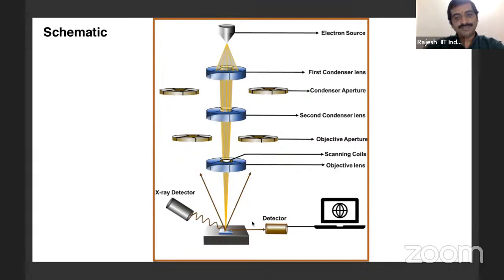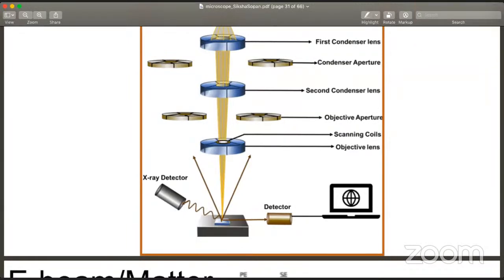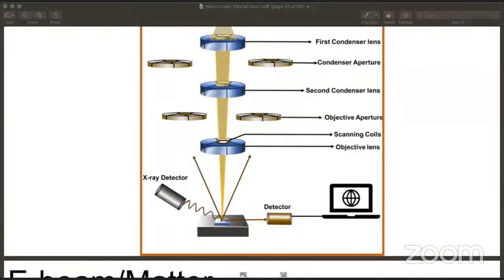If you put it near the surface, the secondary electrons are mostly here. All these studies have been done to understand where the secondary electrons are more in number, or how the number of secondary electrons varies depending on the angle on the surface. The detector is everywhere, and from there it can distinguish whether that's a backscattered electron or a secondary electron. Is that okay? Yes, sir. Thank you.